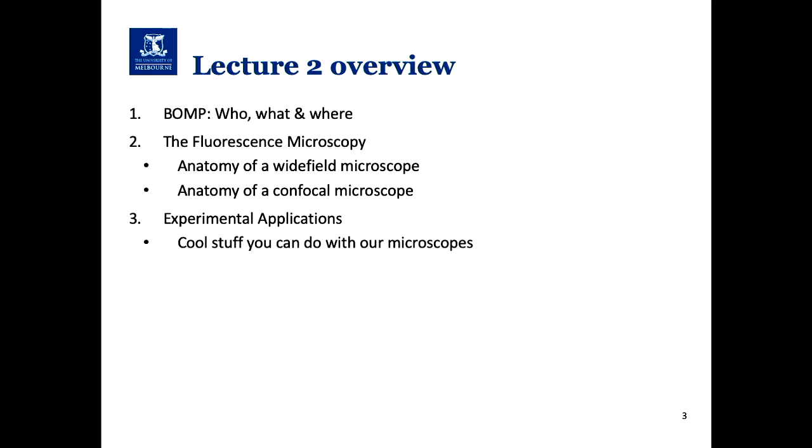So first of all, we're going to cover BOMP. I'm the manager of the Biological Optical Microscopy platform here at the university. So we're going to cover the who, what, and where of what BOMP is very briefly. We'll then spend quite a bit of time going through fluorescence microscopes. And what I'm going to do is explain the anatomy of a standard wide field or epifluorescence microscope and compare that against a confocal microscope, so you get an idea of how those two different systems work and what the key differences between them are.